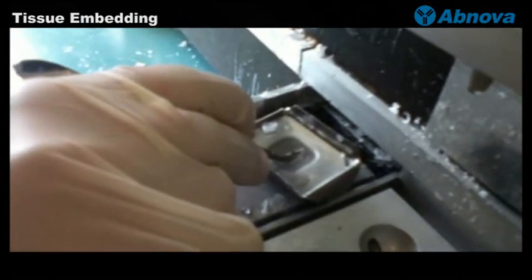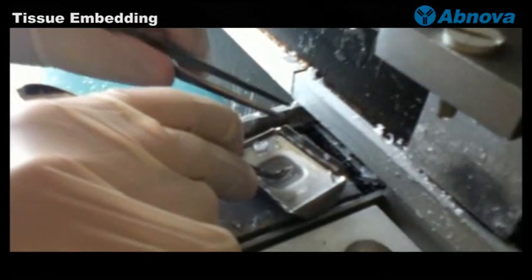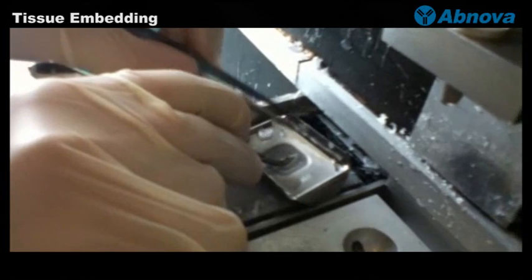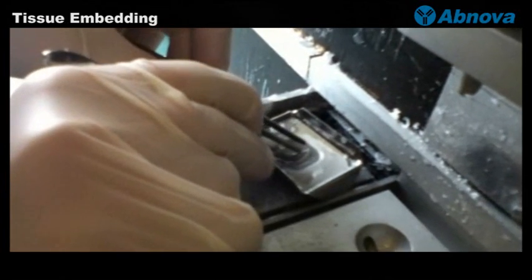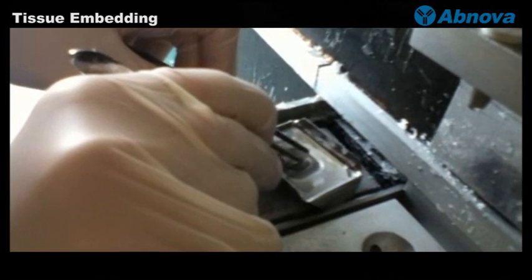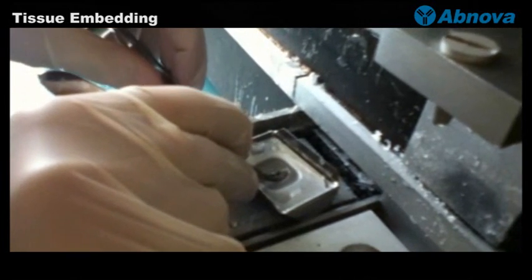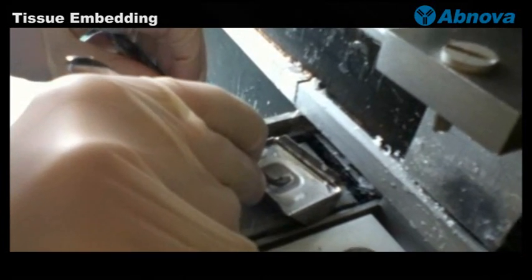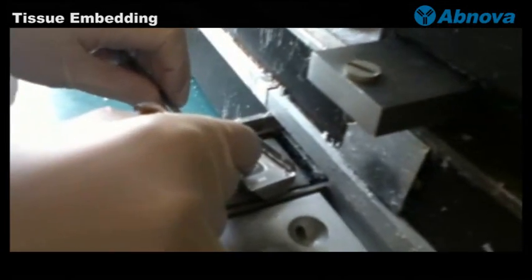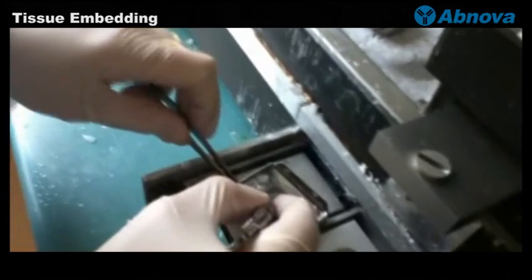You have to press the tissue against the filter cutting side of the block so that it will be close and oriented well to that side. With the other forceps you can loosen the forceps, and you can do everything on the cold surface.